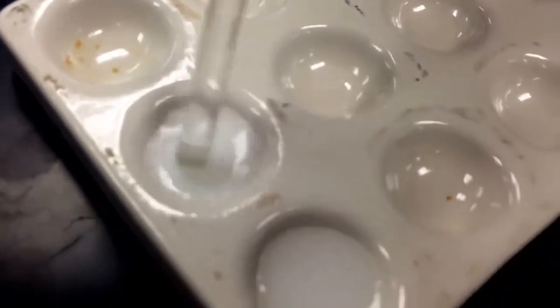And you see some white spots down there. I don't know if you can see it in the camera, but there's some white precipitate. See right there, some white powder.